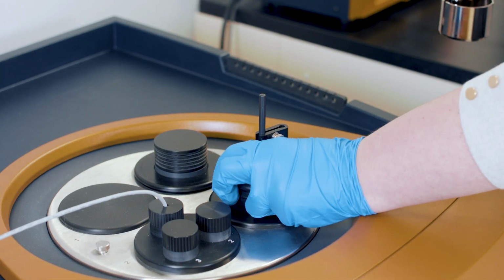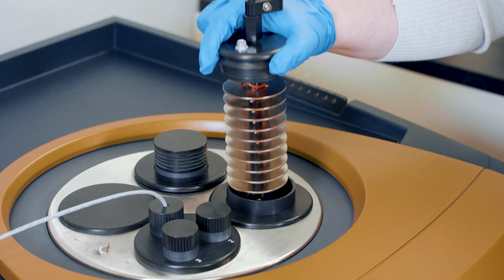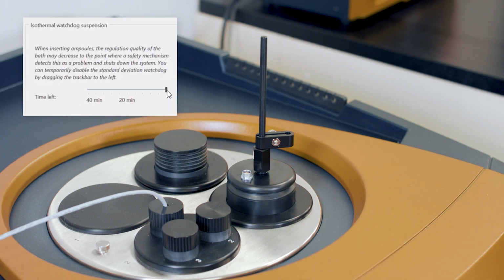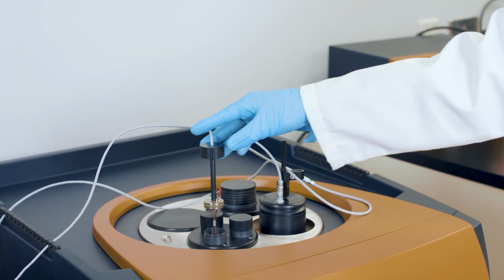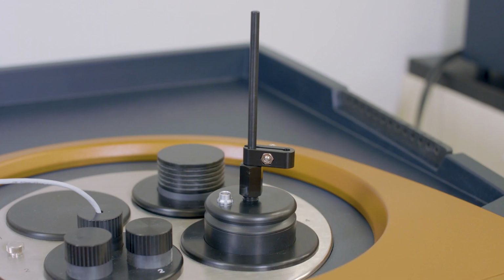Lower the assembly into the equilibration position for at least 30 minutes for the Macrocalorimeter. Depending on the set temperature of the thermostat, you might want to temporarily disable the watchdog during the loading process. If you are using the 20 ml Mini-calorimeter, you should equilibrate for at least 15 minutes using the built-in magnet. After the equilibration period is complete, lower the sample holder into the measuring position and let the calorimeter signal stabilize. This will take at least 45 minutes.